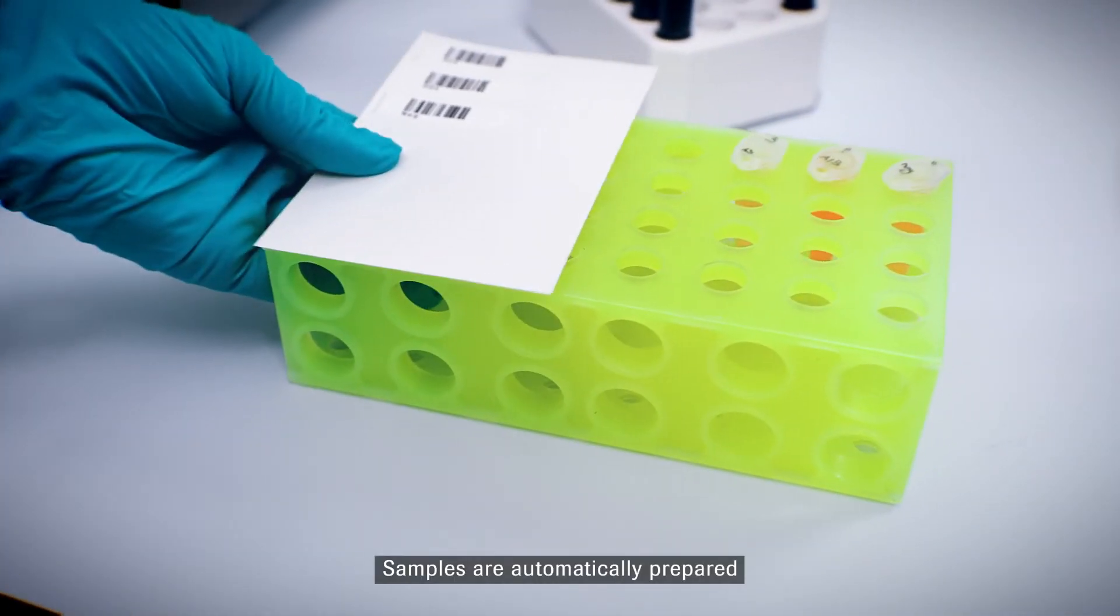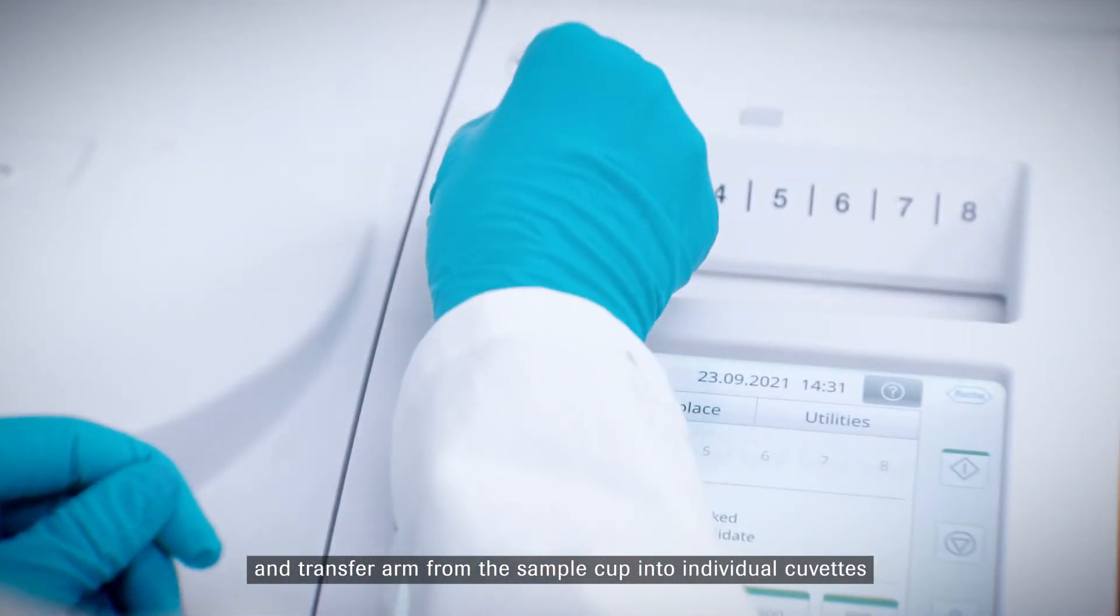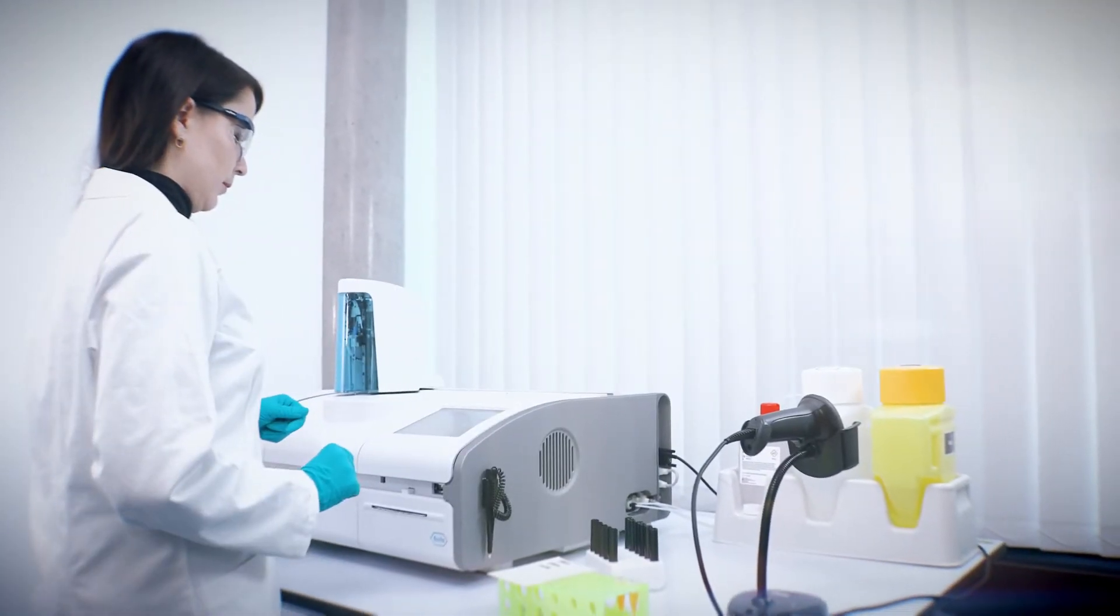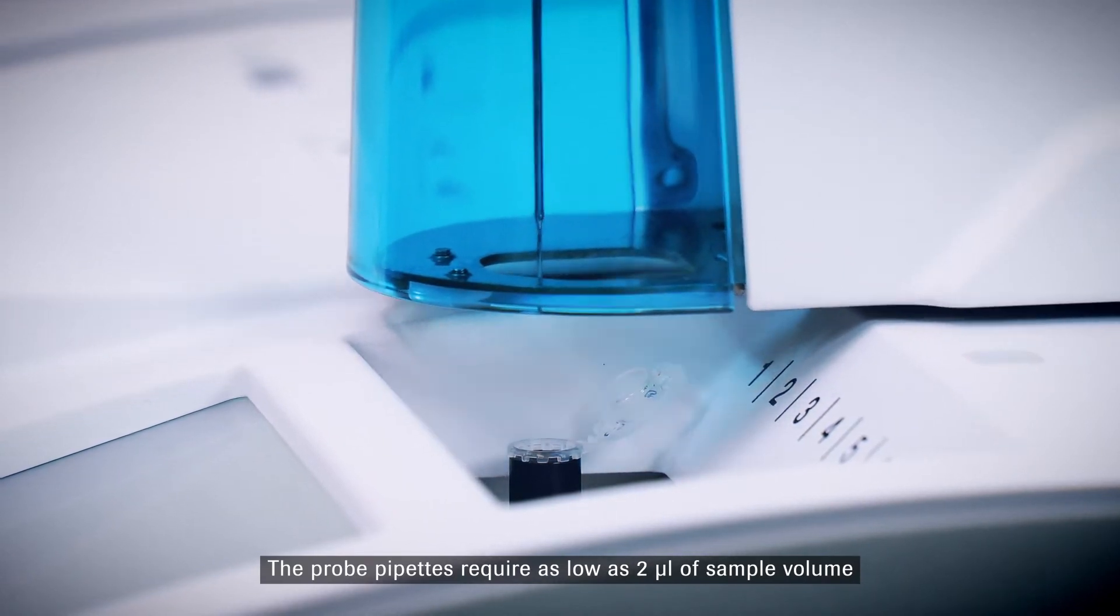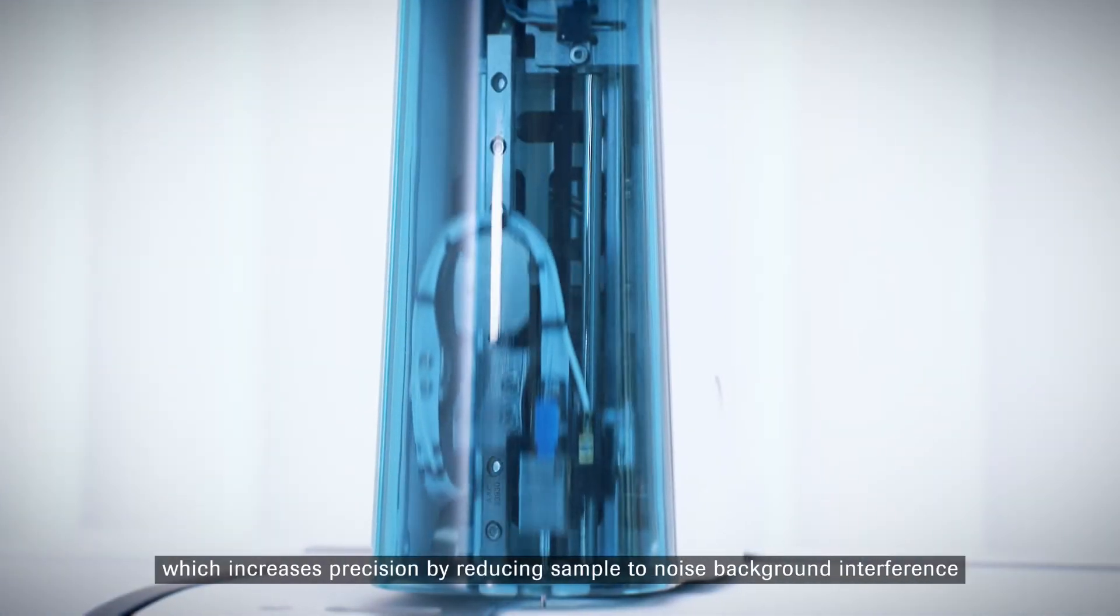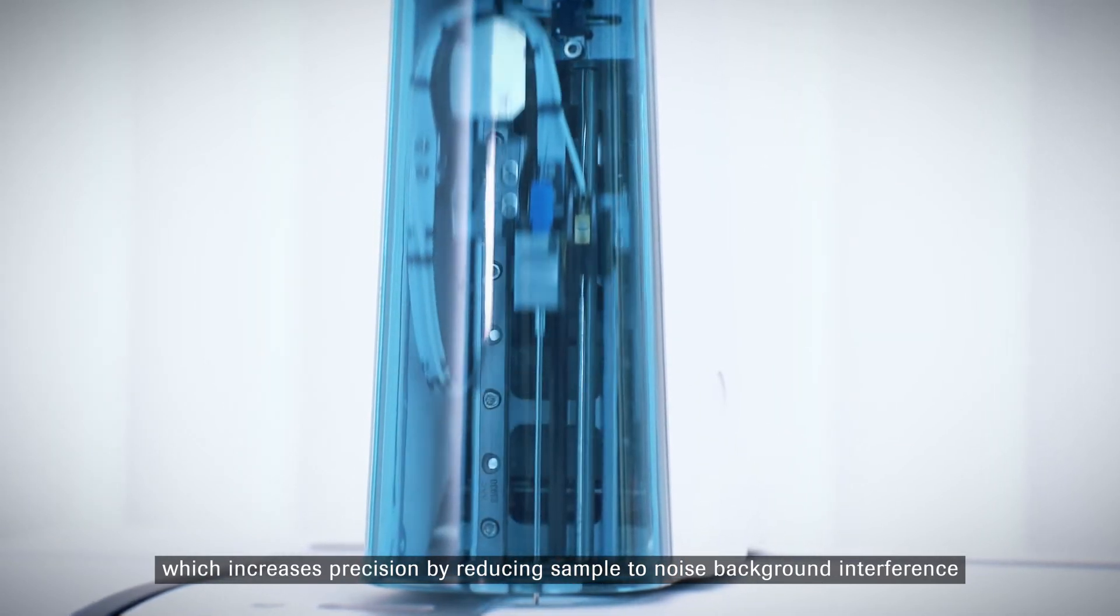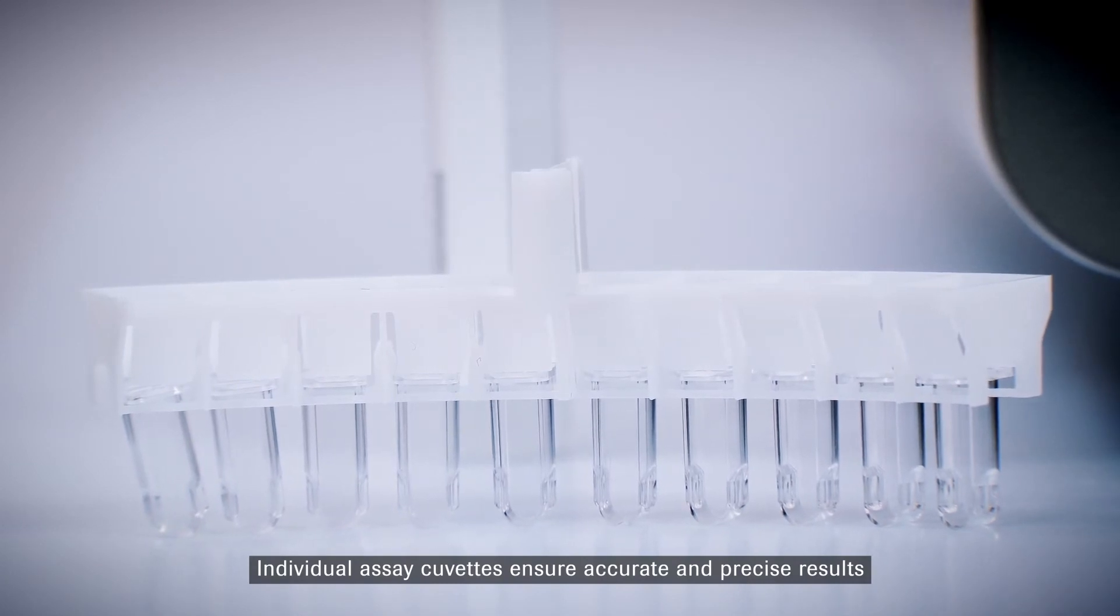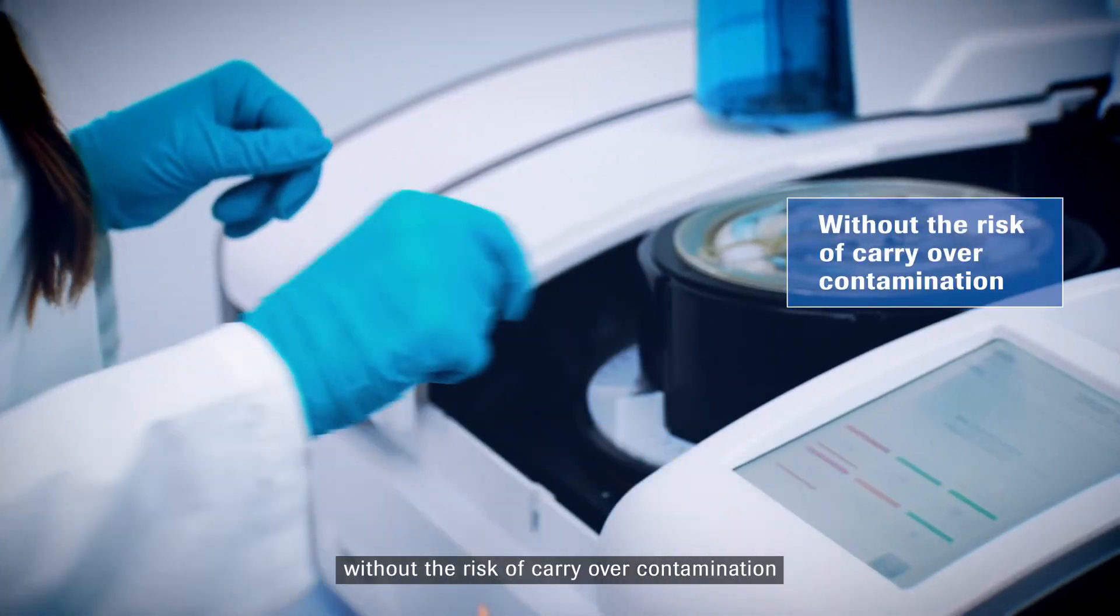Samples are automatically prepared and pipetted by the probe and transfer arm from the sample cup into individual cuvettes. The probe pipettes require as low as 2µL of sample volume, which increases precision by reducing sample-to-noise background interference. Individual assay cuvettes ensure accurate and precise results without the risk of carryover contamination.